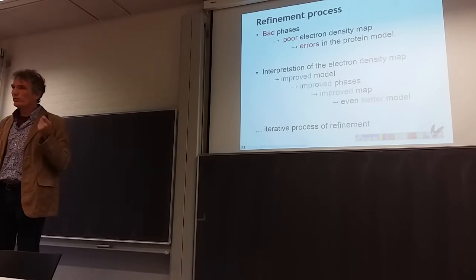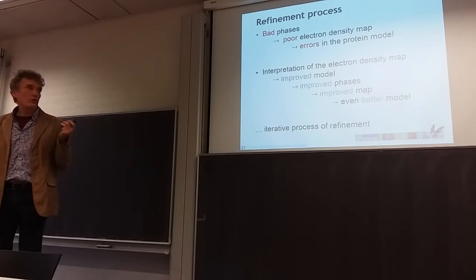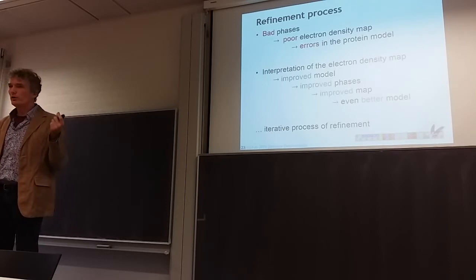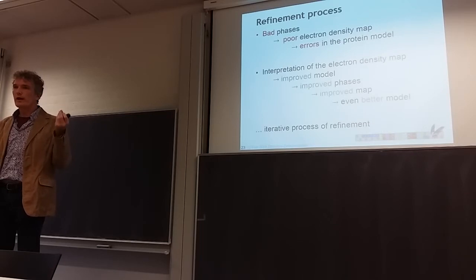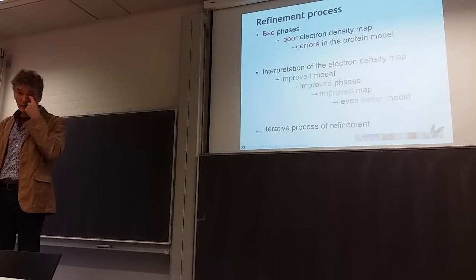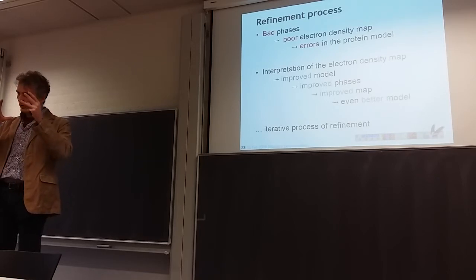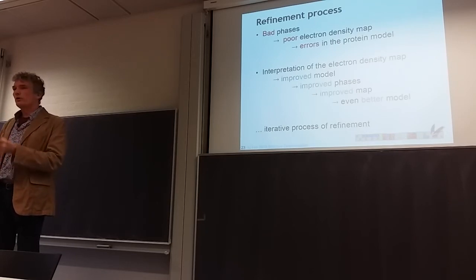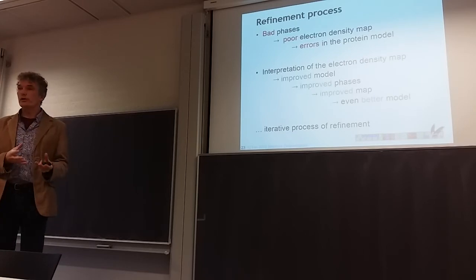Yeah. So this also involves quite a lot of modeling in the sense that we know known bond lengths, angles, and so on. Even force field calculations, energy minimizations, and sometimes even simulation methods are used to help this process along. So there's a lot of model knowledge going into this on top of the experimental data.